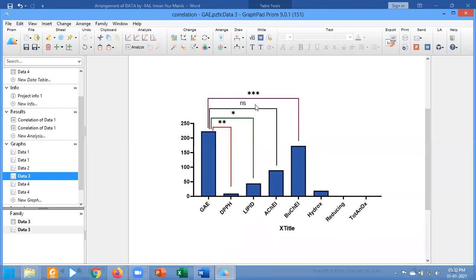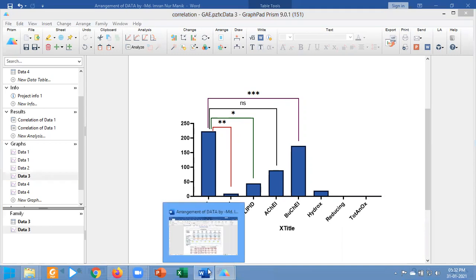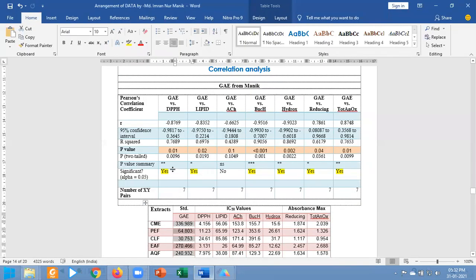Now I am going to signify the relationship between gallic acid and hydroxyl radical. From the previous analysis it has been found that the hydroxyl radical has two-star significance with the gallic acid.